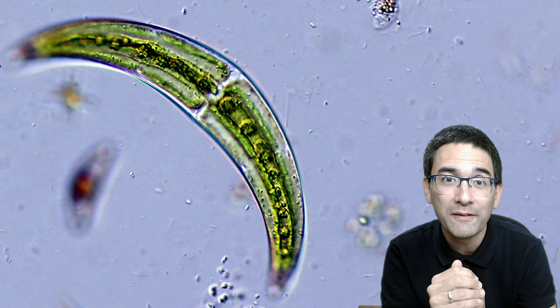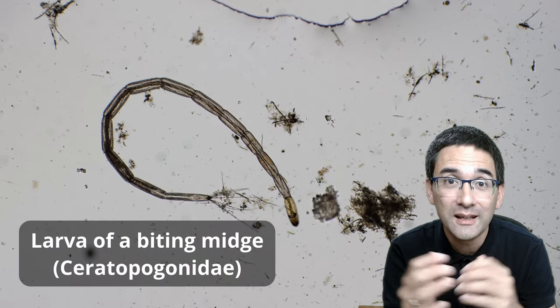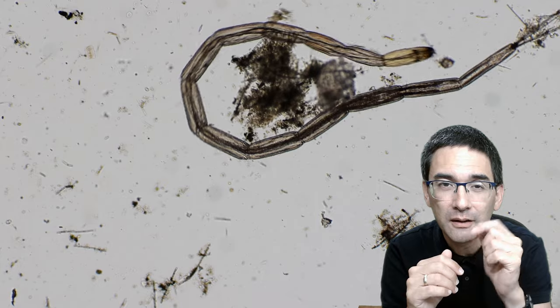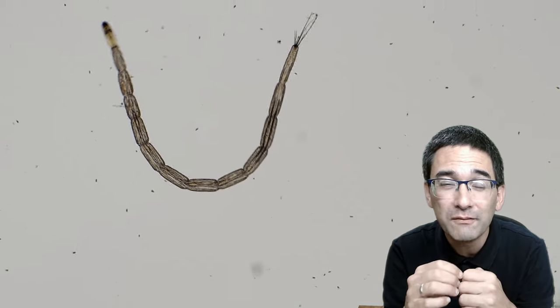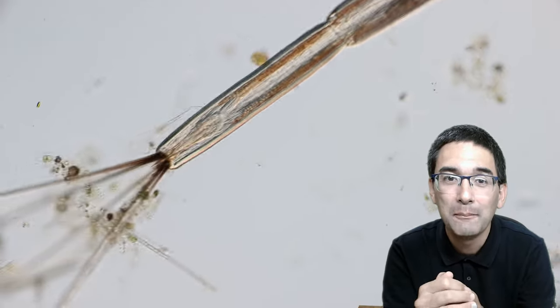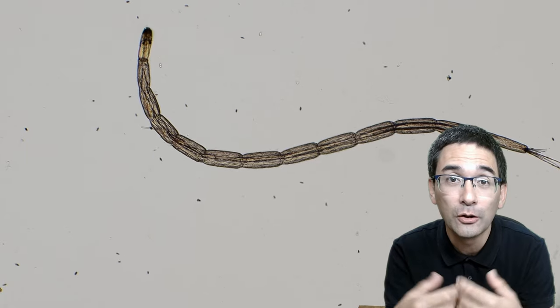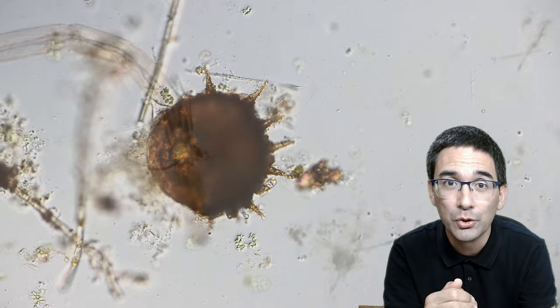I did not only find algae but also larvae. This is not a worm — it is the larva of the biting midge. A biting midge is a type of fly and it apparently causes a very painful and itchy bite when it attacks you. Many of those insects lay their eggs in the water and the larval stages develop in the water before the adults emerge.